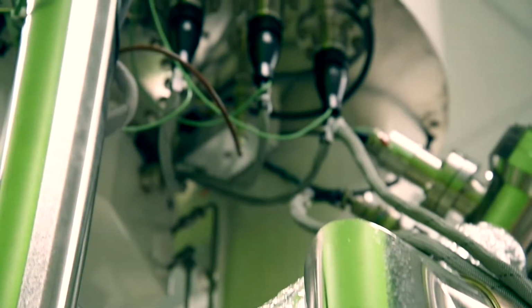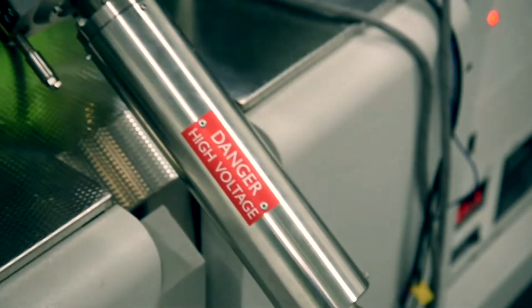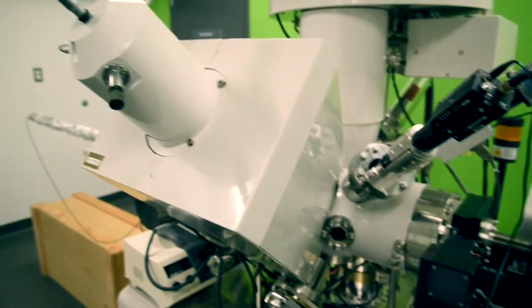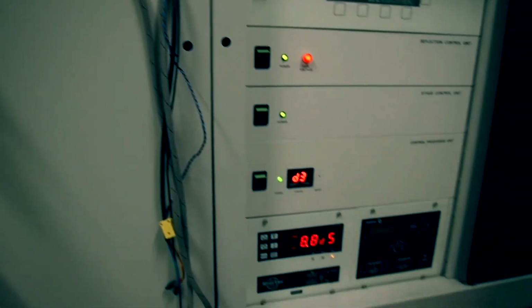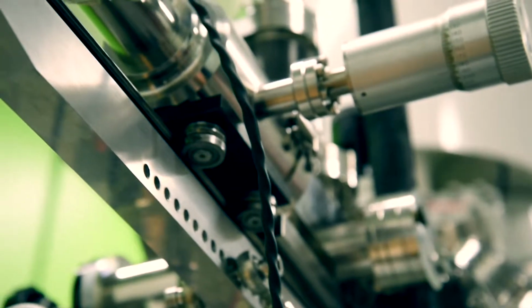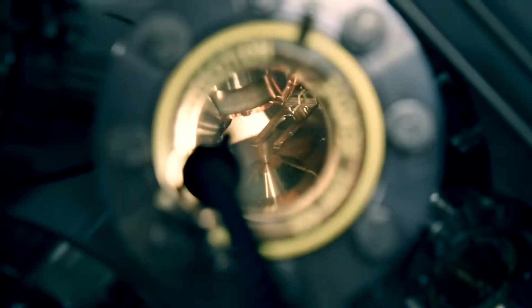With the addition of an ion gun to etch away the surface, XPS can be used to look at the composition of multi-layered materials, like transistors and fabricated electronic devices, where the layer thickness and interfaces play critical roles in device performance. Coupled with a charge neutralizer, the XPS can examine both insulating and conducting samples, making this technique applicable across the broad research interests of MIM members.